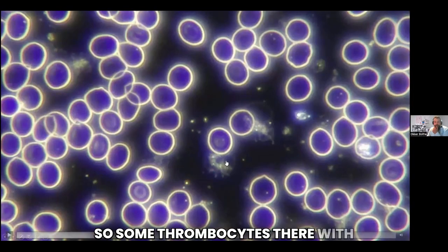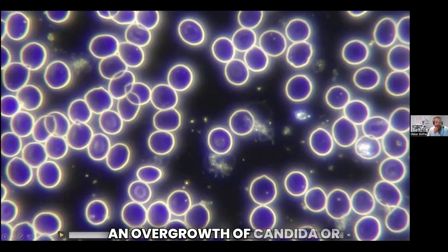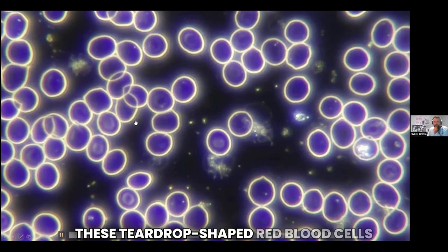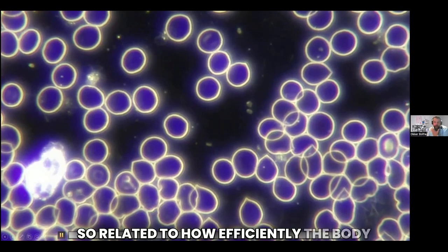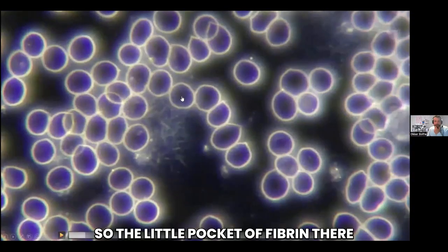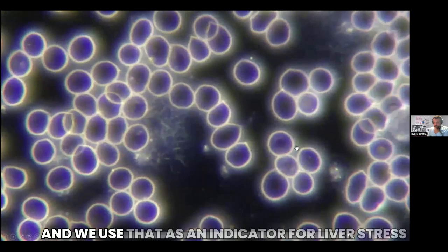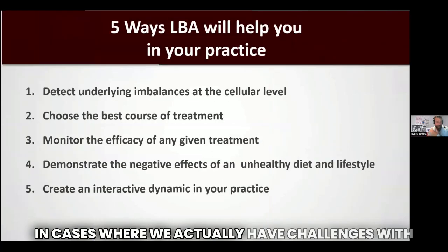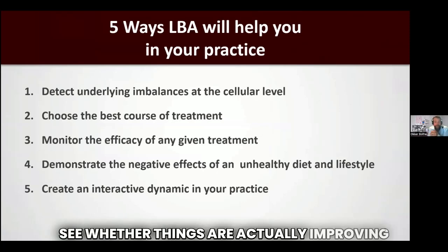So some thrombocytes there with some fermentation patterns around them. These sort of things we tend to see when there's an overgrowth of candida in the system, intestinal dysbiosis. These teardrop-shaped red blood cells also indicate poor protein digestion, so related to how efficiently the body deals with and metabolizes protein. And the little pocket of fibrin there, these white lines, that's fibrin that forms in the blood, and we use that as an indicator for liver stress, so very useful to track in cases where we actually have challenges with the liver. We can look at those and see whether things are actually improving.